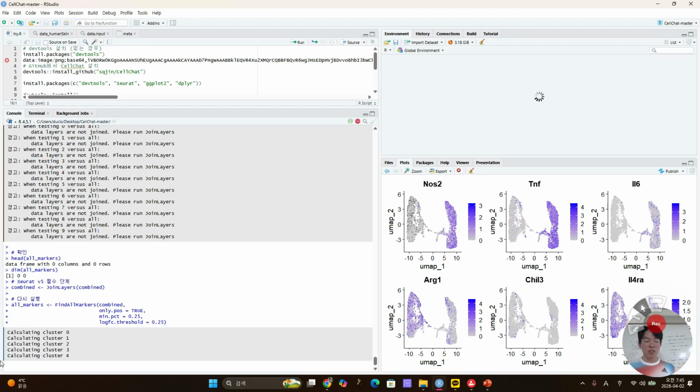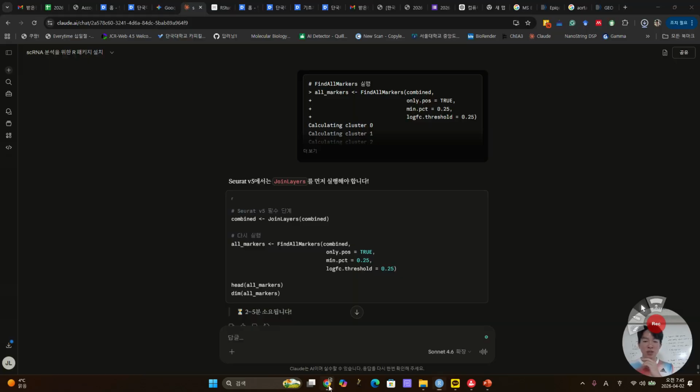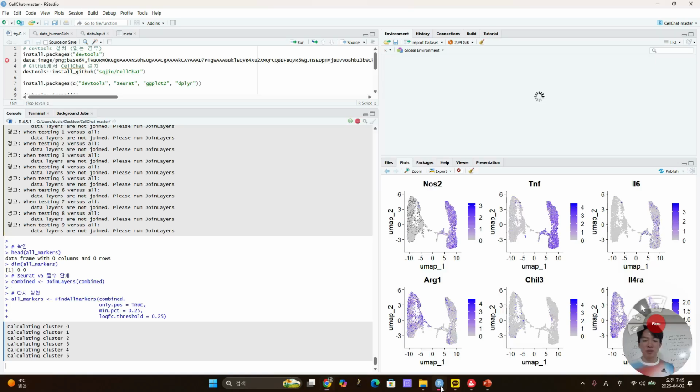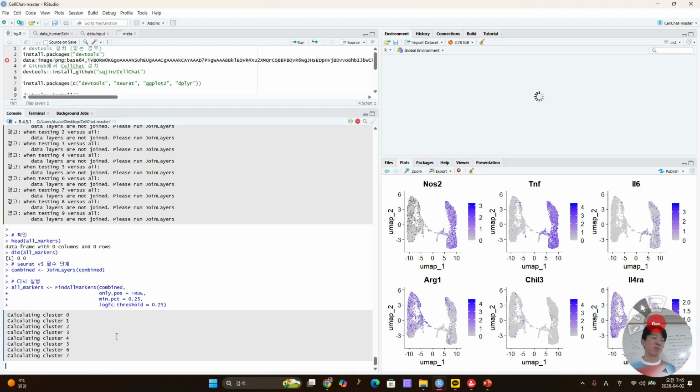So this is how you can do analysis based on AI. In my opinion, I only use Claude for analyzing, because I heard that Claude is best for giving code, but ChatGPT or Gemini, I don't think you can do anything. So any questions? You can see how they're analyzing, or you can leave after giving me any questions.